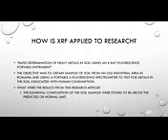The objective of this research was to obtain 10 samples of soil from an old industrial area in Romania, with the use of a portable X-ray fluorescence spectrometer, to test for metals in the soil associated with the production of food, recycling water, and other raw materials that society consumes. The scientists who conducted this experiment found that the elemental composition of the metals and minerals in the soil samples were above the normal limit.